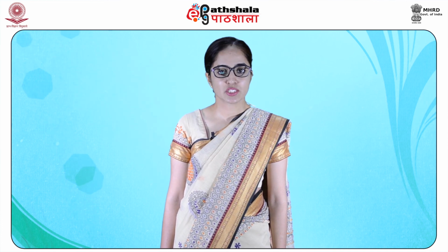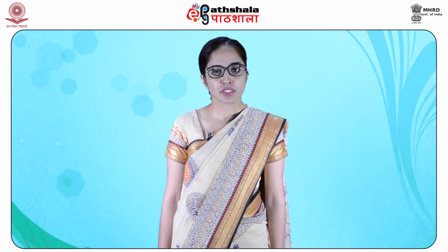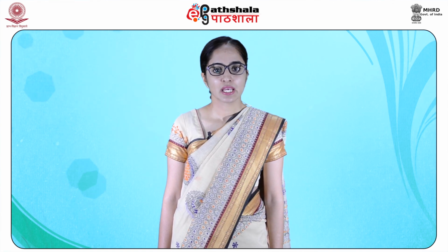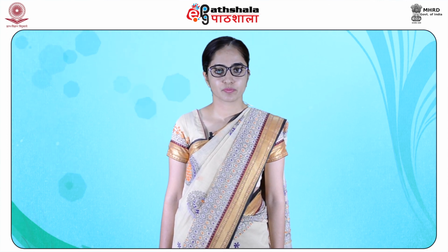At high field strength, most proton spectra become first order. It is important to notice that high field NMR instruments give better resolution and relatively easily interpretable spectra.